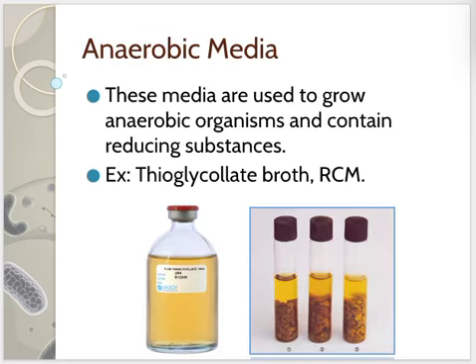Anaerobic media are specialized to support the growth of bacteria that can't tolerate oxygen. These media contain reducing substances that create an oxygen-free environment essential for cultivating anaerobes. Thioglycolate broth and RCM are typical examples. The growth patterns in these media help us identify and study anaerobic bacteria, which behave differently compared to those that thrive in oxygen.